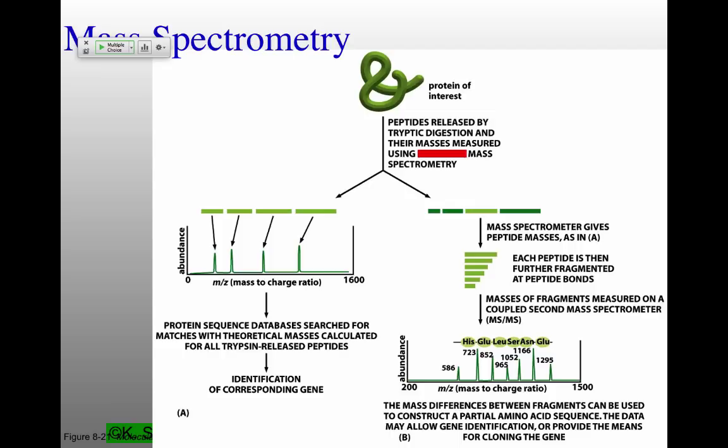And so the idea here is you take your protein, this could be a spot on one of your 2D gels, it could also just be a protein that you're working with in your lab. My postdoc took one of these up the hill to HSU to get this analysis done earlier this week. So you have this protein, it gets broken into smaller pieces, these individual peptides, and then the mass to charge ratio, which will give you a mass, is determined to extremely high precision.